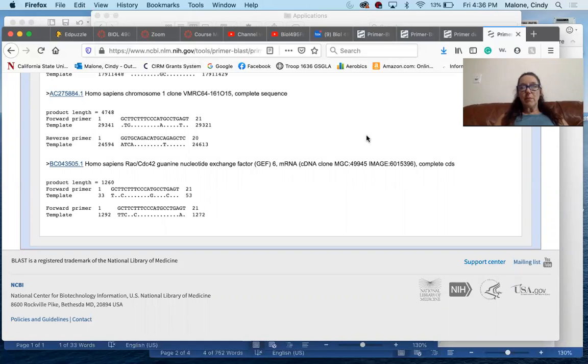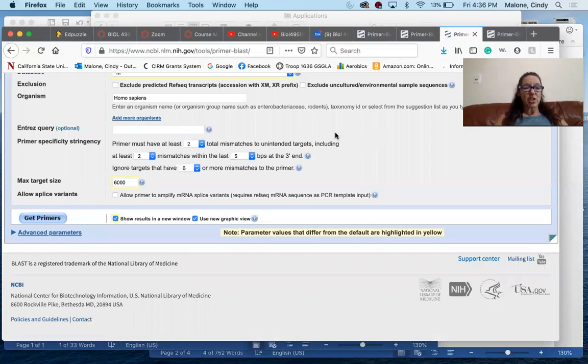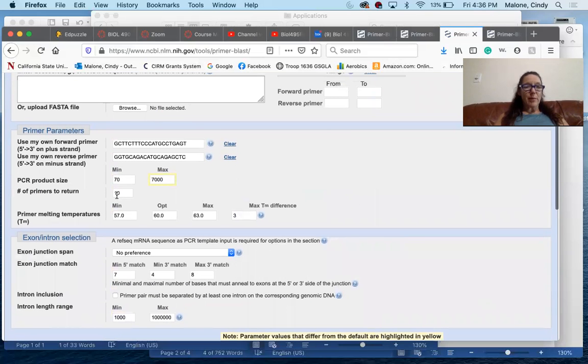Now, the only thing we might want to change would be number of primers to return.